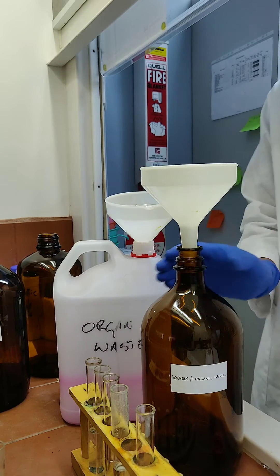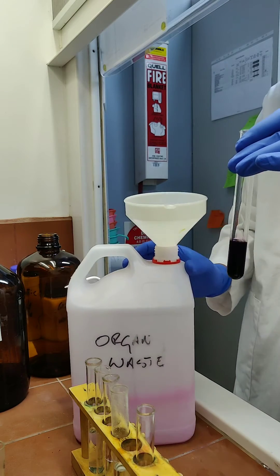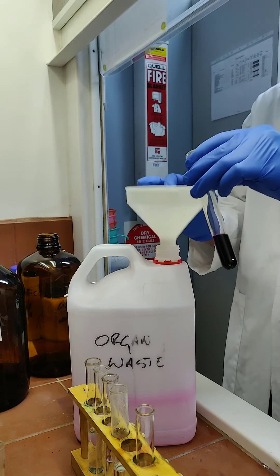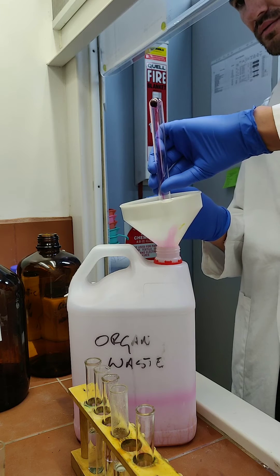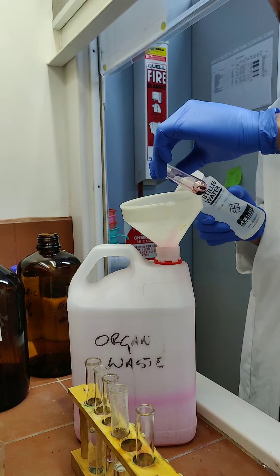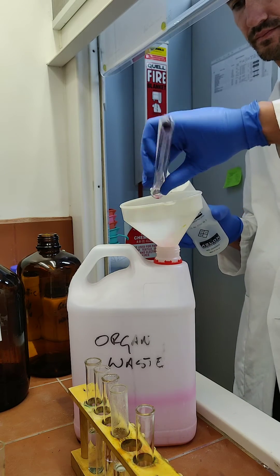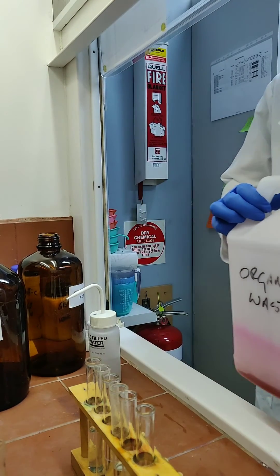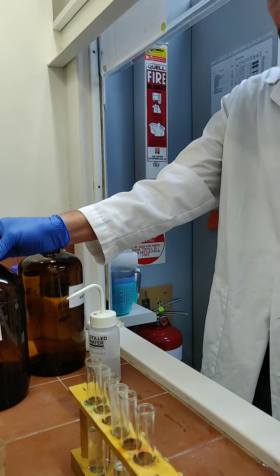Next, we'll discard the iodine crystals that are dissolved in cyclohexane. Again, make sure you have a funnel in the top of the waste jar. Pour it out and then rinse out the tube.